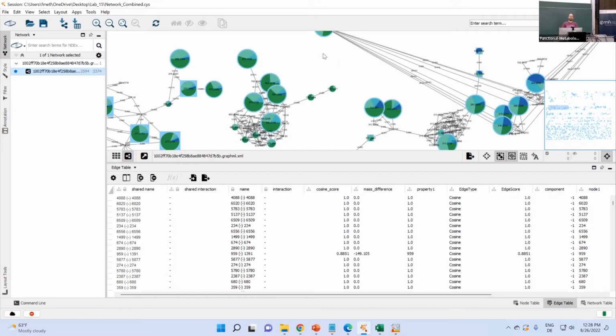Oh, but they should. The identifications from GNPS should be in there by default if you open the GraphML file, so they're already in there. Okay. Maybe don't worry about Sirius so much right now, but try to import the stats instead, because right now I want to look mainly at compounds identified by library matches. Those are the most valuable ones anyway. And later on you can try with the Sirius TSV.